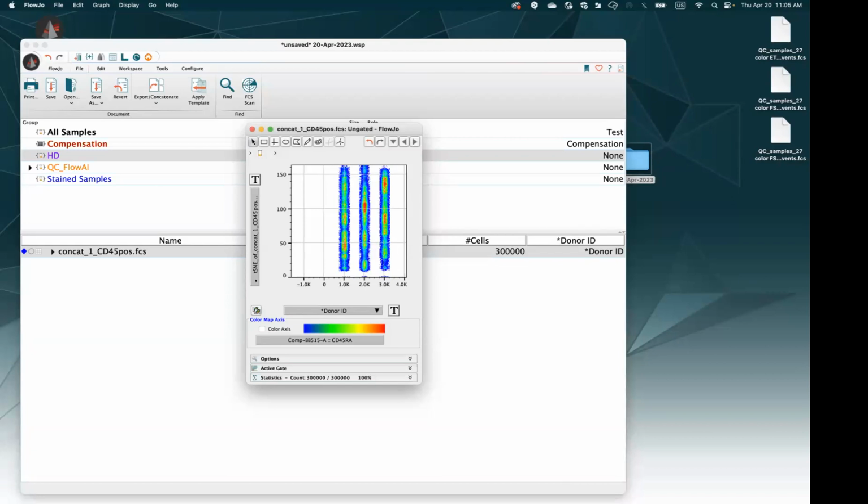And then at the stage of the concatenation, shall we include only viable single cells, doublets removed at this stage, or does it not matter? So yeah, we should exclude the dead cells. We should exclude the doublets and any population. So we're just going to place our normal gates, and if you have a dump channel, you would also remove those.